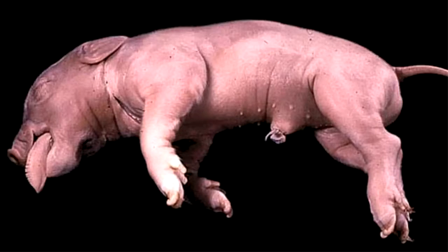Okay, well, that brings us to today's main lesson, and that is learning about the anatomy of the fetal pig. All right, once you learn the anatomy of the fetal pig, you can pretty much have a good idea of what your own anatomy is. Internal anatomy is the most important. I'll point out differences as we go along, and we'll make sure that you guys are aware of the two.